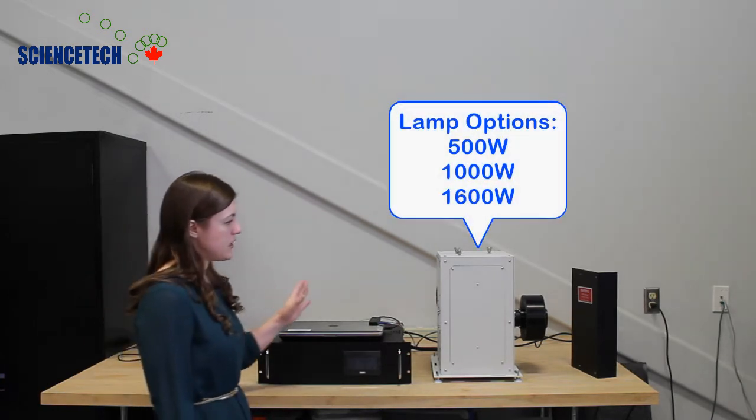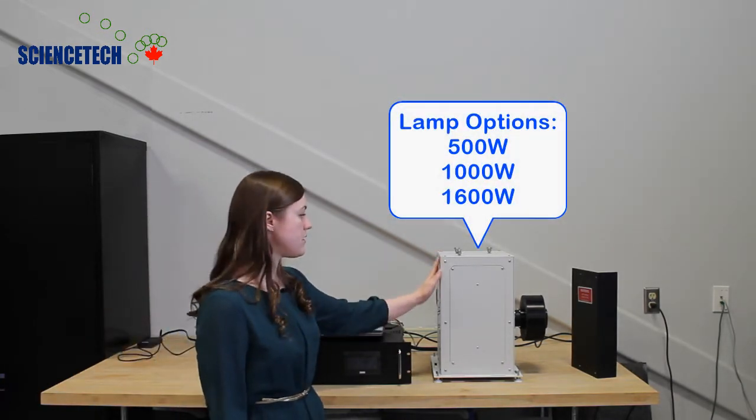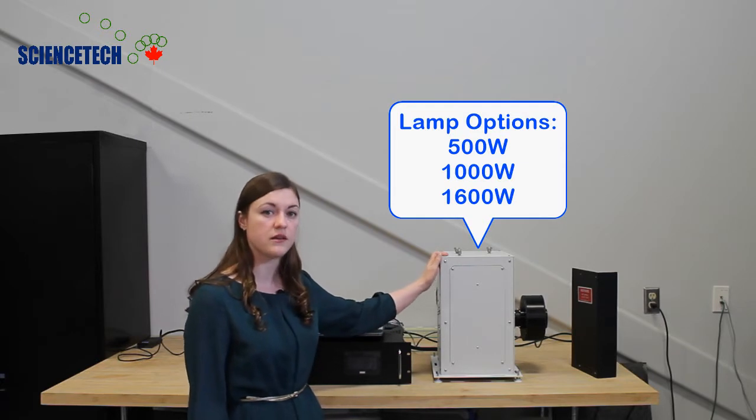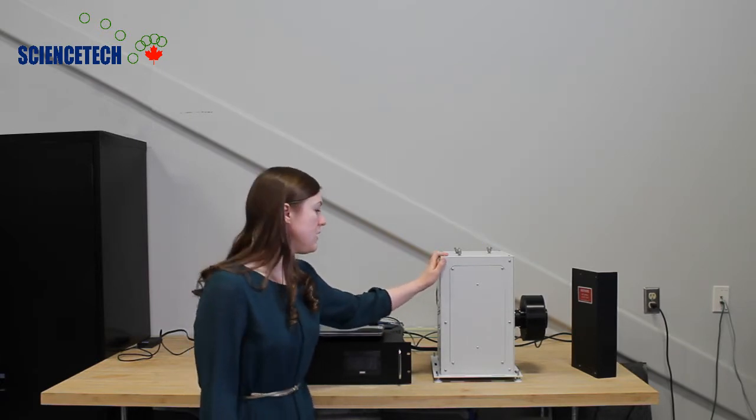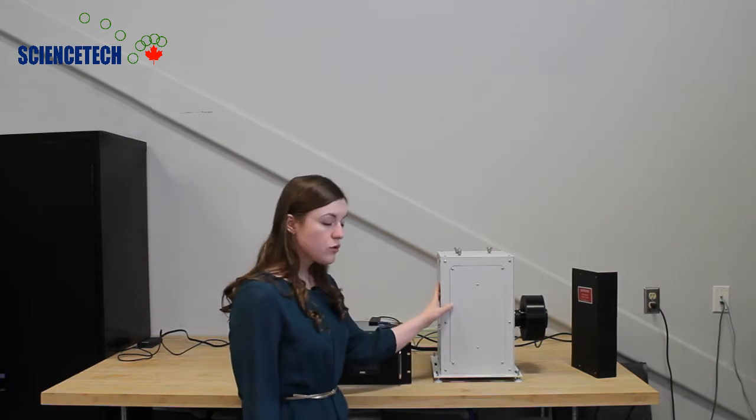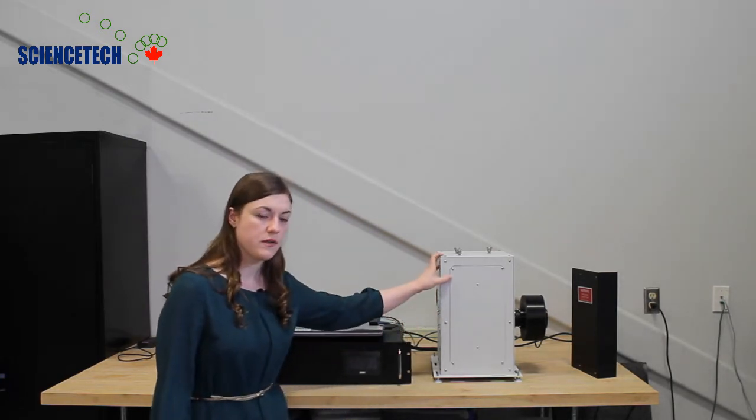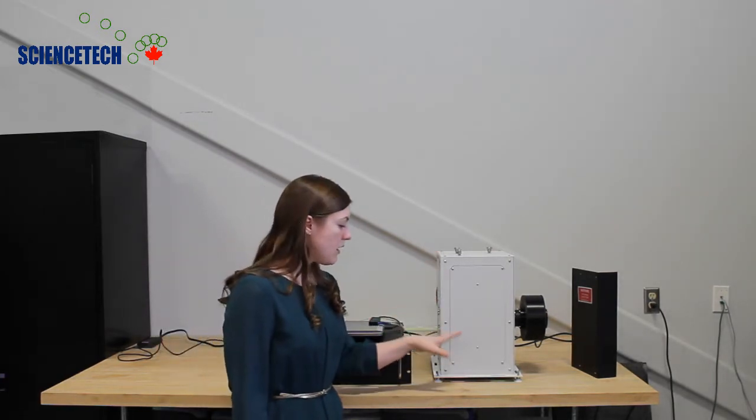This housing can accommodate 500 watt, 1000 watt and 1600 watt Xenon short arc lamps. Right now it's in the vertical orientation but it can also be operated in the horizontal orientation. Either way the base plate is available with leveling feet.